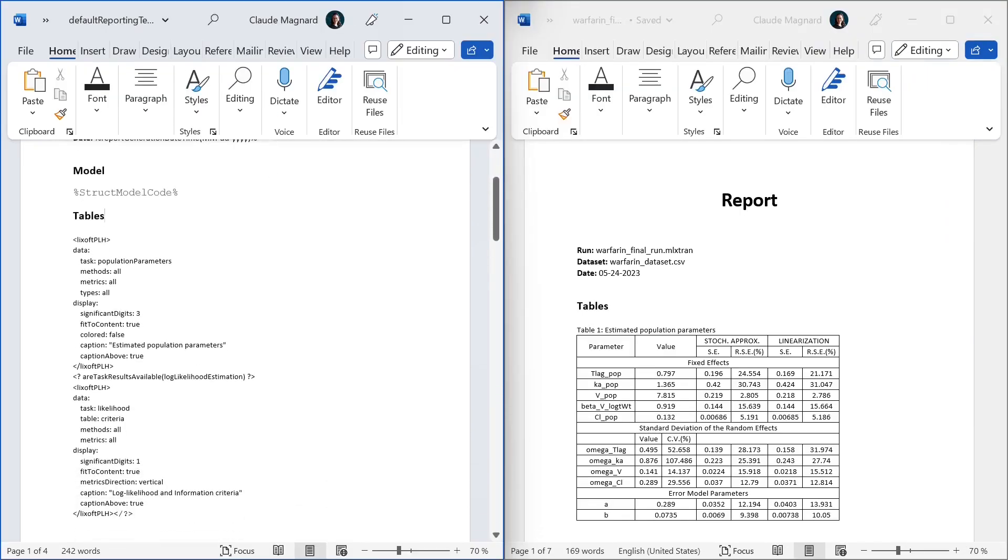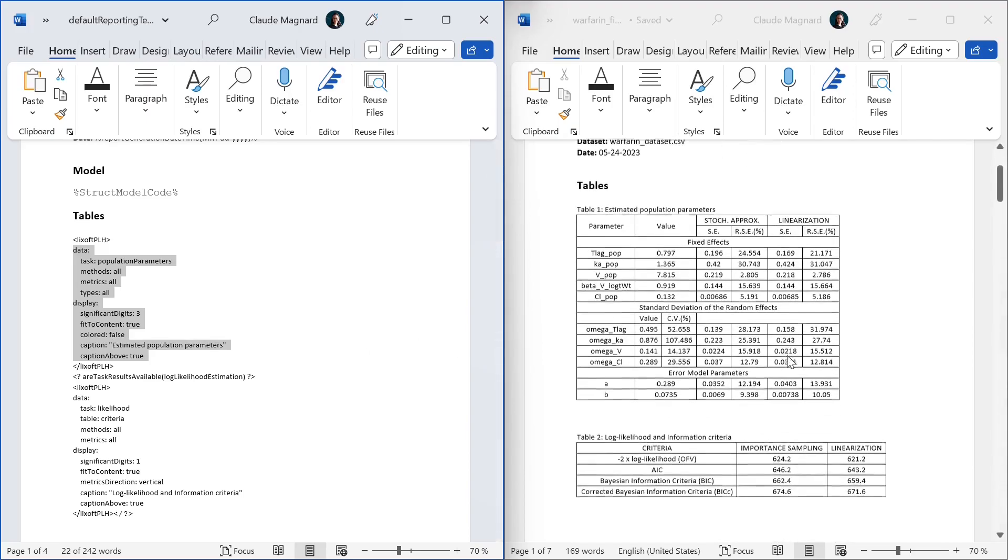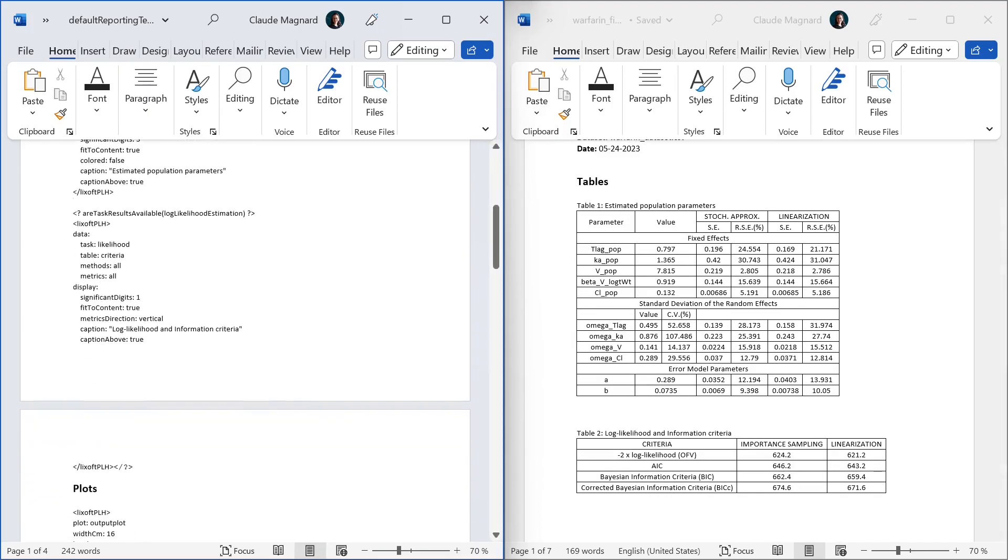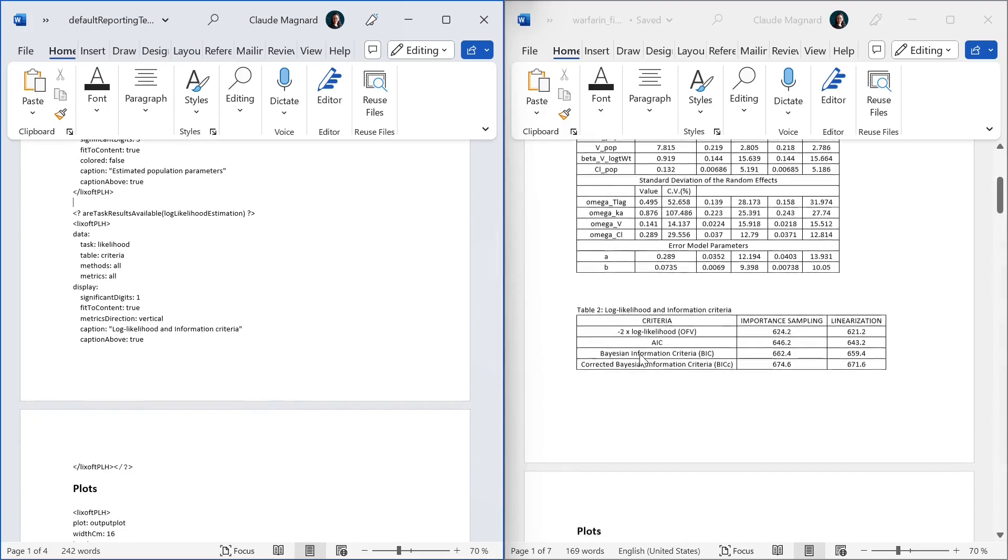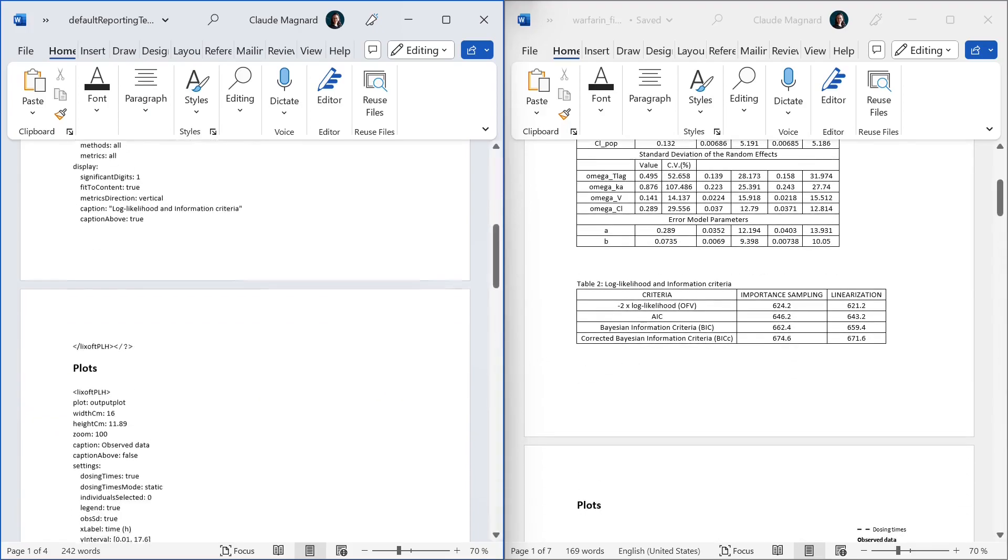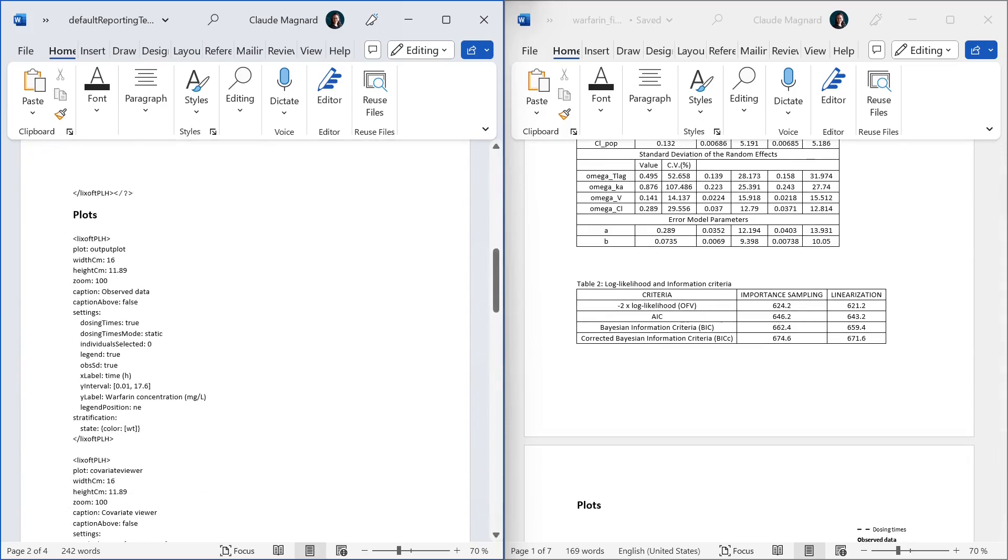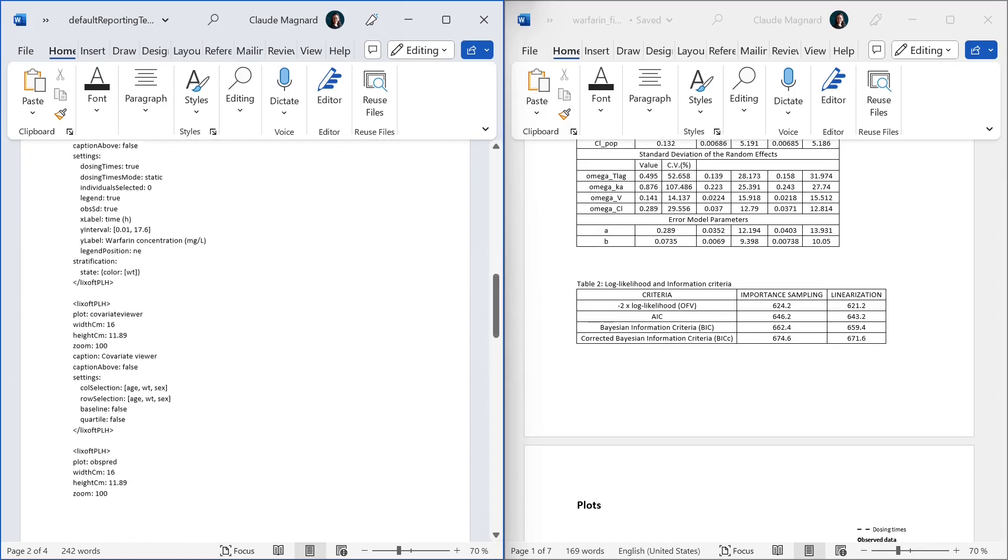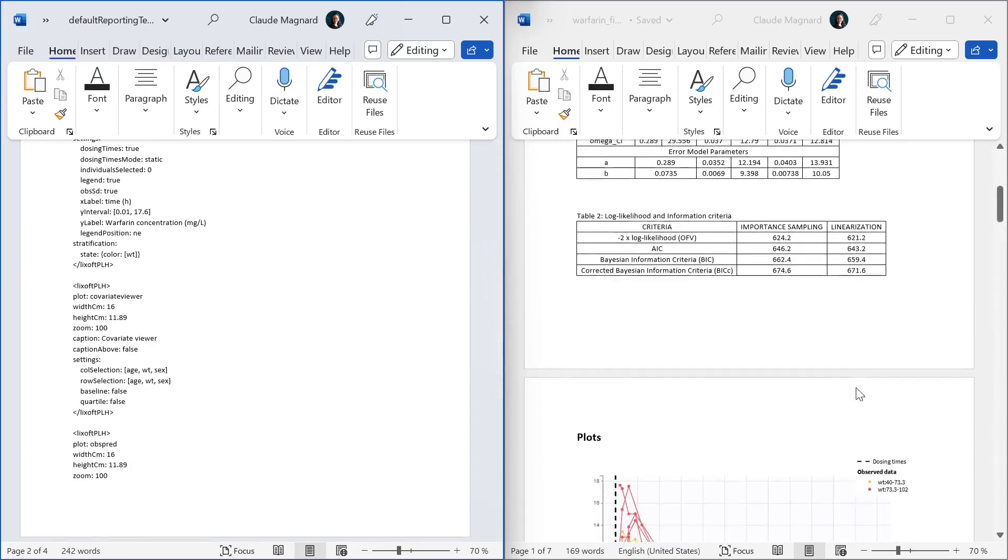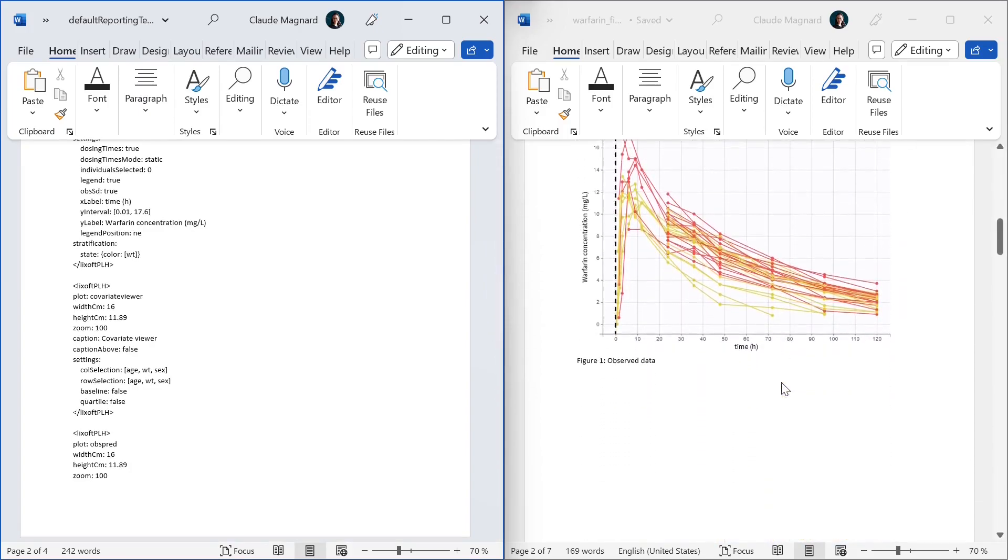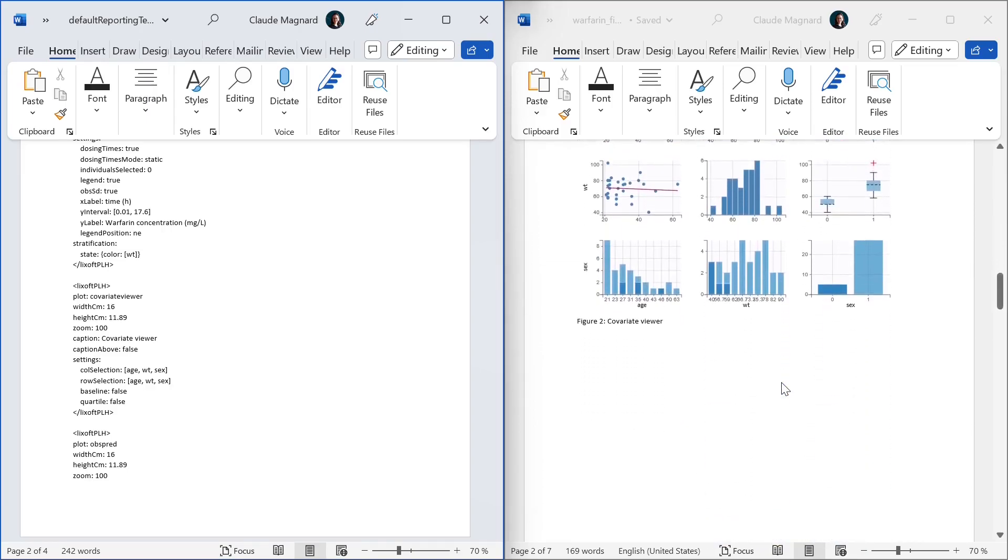In the table section, this whole bunch of text surrounded by Licksoft PLH words is what we call a placeholder. When generating the report, the placeholder has been replaced by the table of population parameters. The content of the placeholder defines what will appear exactly in the generated table. The next placeholder below has been replaced by the table of likelihood results. If I keep scrolling down, I now have another placeholder for the observed data plot, another one for the covariate viewer, etc. And each element that you want to have in your report should be included in your template as a placeholder containing all the information needed to reproduce the element.